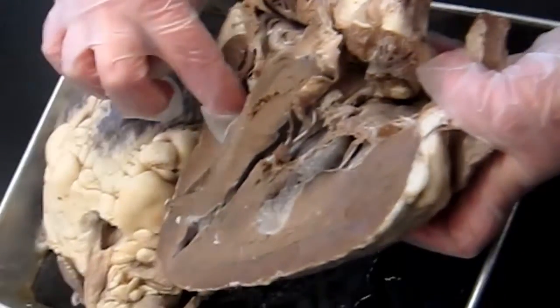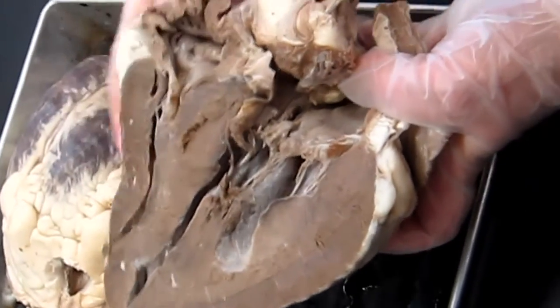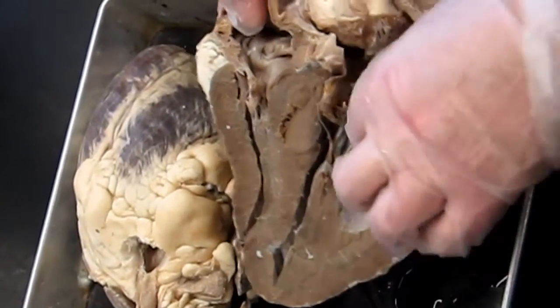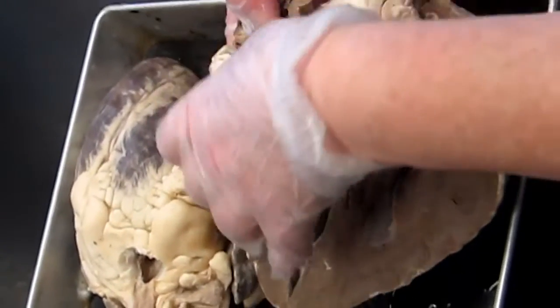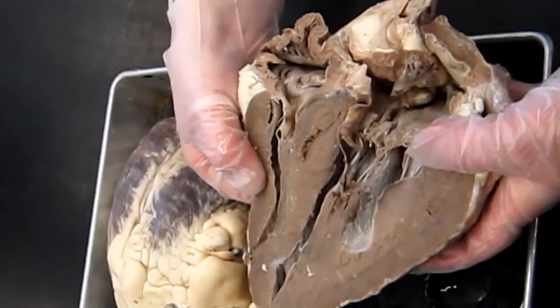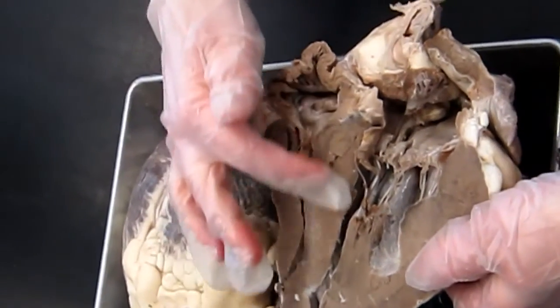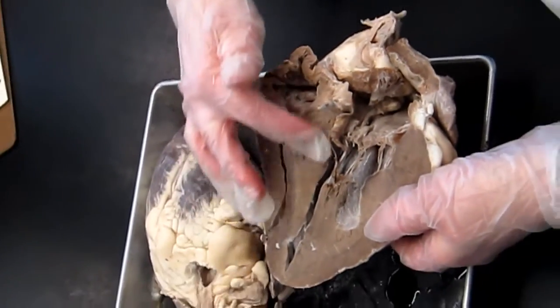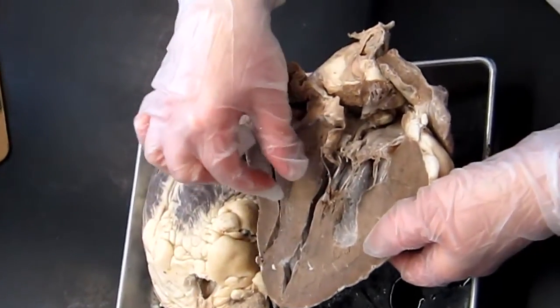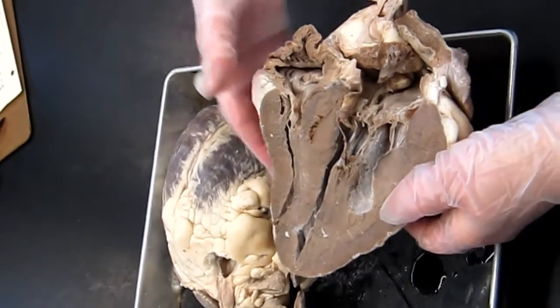Because you can see that there's a big opening here. That's one of the ventricles. And you can see that you've got another big opening here. That's the other ventricle. You can see some things that look like valves. So these look like atria here. So here's one ventricular wall. Here's the other one. You don't want to look at the septum for this. This is the interventricular septum here, but you don't want to look at that for determining right versus left because that's shared by both. That'll give you a false impression. You want to go to the outside.